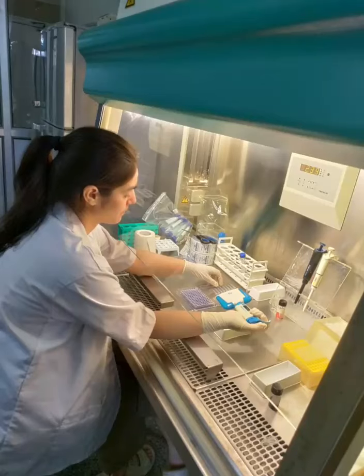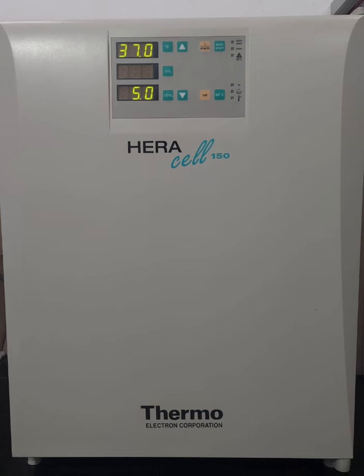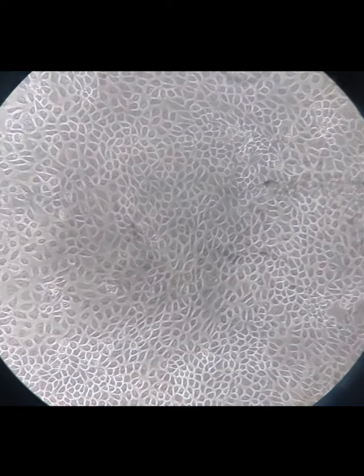In order to see the impact of catechin and quercetin against cisplatin-induced in vitro cytotoxicity and altered antioxidant status in renal epithelial cells, we used NRK52E cell lines. These cell lines were procured from NCCS Pune, and once we received them, we incubated them for a span of 24 hours. After 24 hours, these cell lines were subcultured into different flasks.